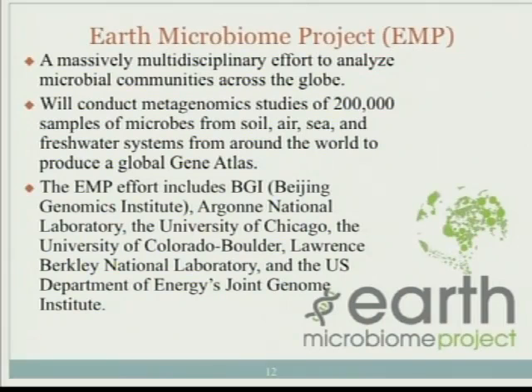So 16S RNA genes are the most conserved gene family. They're very conserved. That makes it possible to design primers so that you can get 16S from all different species. Not really all, but close to all. 16S genes do have very conserved regions and hypervariable regions. So you design the primers against the conserved regions, and then you will be able to amplify both conserved and variable regions. Yes?